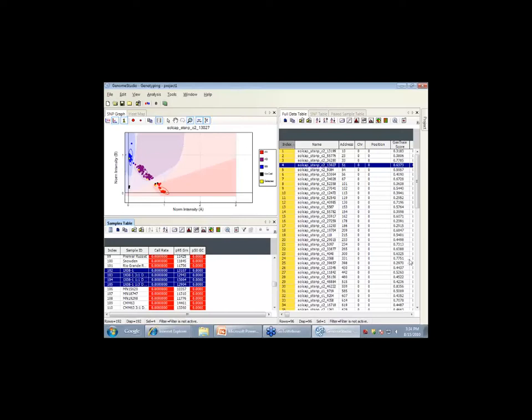We see a nice dose response in the clusters. So this is a control plate that SolCAP put together. We capture about 40% of the loci with about 3-4 mixtures of diploids. So this is what we're going to use to help define those clusters. We have spiked samples where we see the dose, and we're seeing this works pretty well.